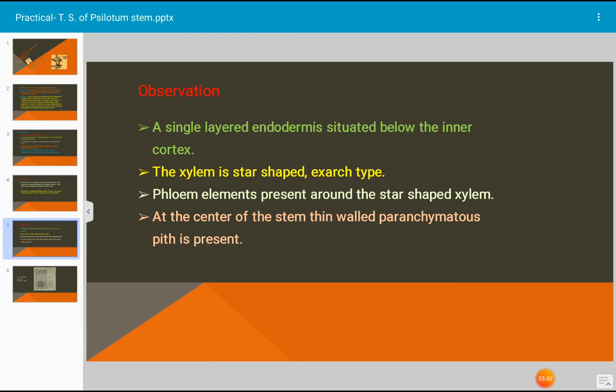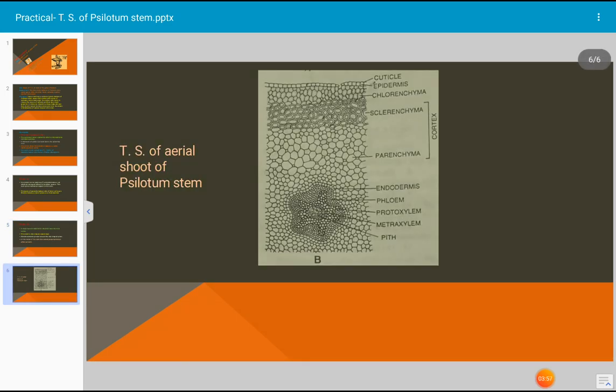At the center of the stem, thin walled parenchymatous pith is present. This is the photograph or figure of transverse section of stem of Psilotum or shoot of Psilotum. This is all about internal structure or transverse section of stem of Psilotum.